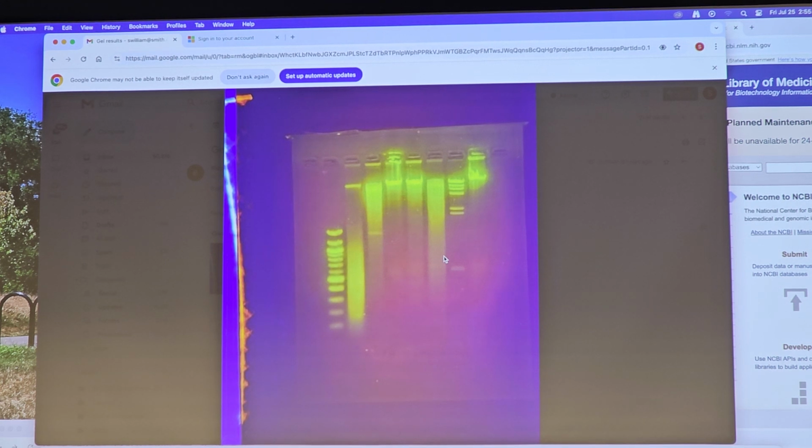Yeah, MspI always looks like it's not cutting up to its potential, and I don't think it's the enzyme. It's known that in the human genome, there are fewer CCGG sequences than you'd expect, so it doesn't occur once every 256. It's much less frequent than that, and that's partly because the human genome isn't 50% GC and 50% AT, it's actually 60% AT.